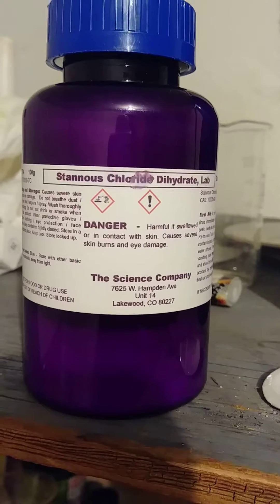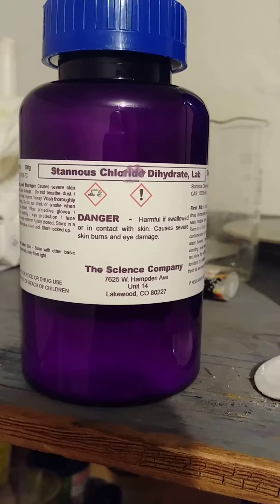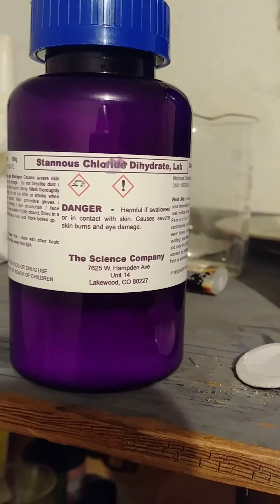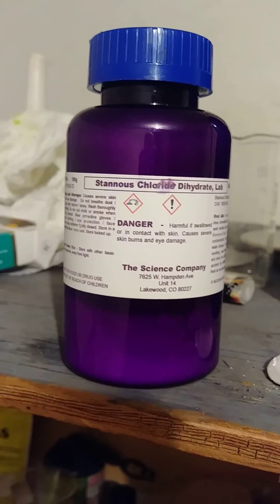Stannous chloride dihydrate — as you can see it's from the Science Company. I paid about $25 to $30 for this. I live here in Colorado in Lakewood; it's about 10 minutes from my house so it's pretty convenient for me. And that's how I make my stannous. Later!